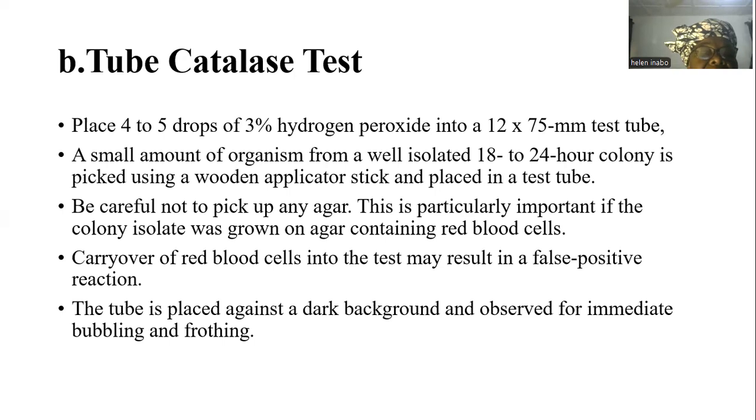It's important to be very careful in picking this isolated colony, because if the colony is picked from an agar containing red blood cells, a false positive reaction may be observed because of the carryover of red blood cells into the test tube. The tube is now placed against a dark background and observed for immediate bubbling and frothing.